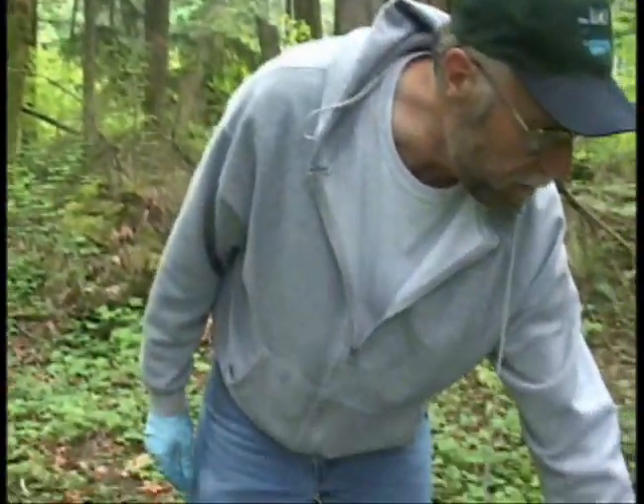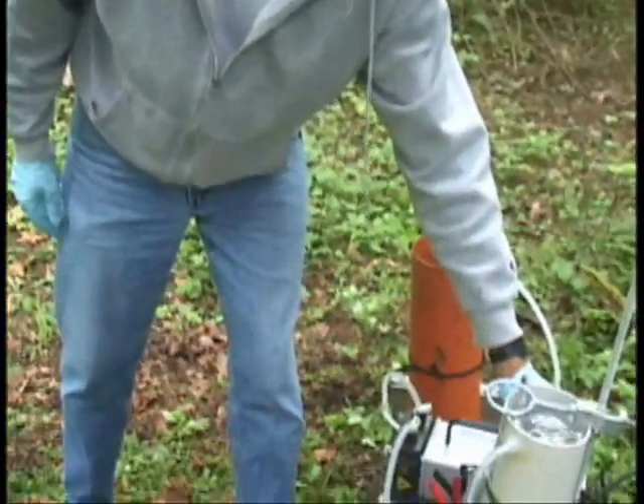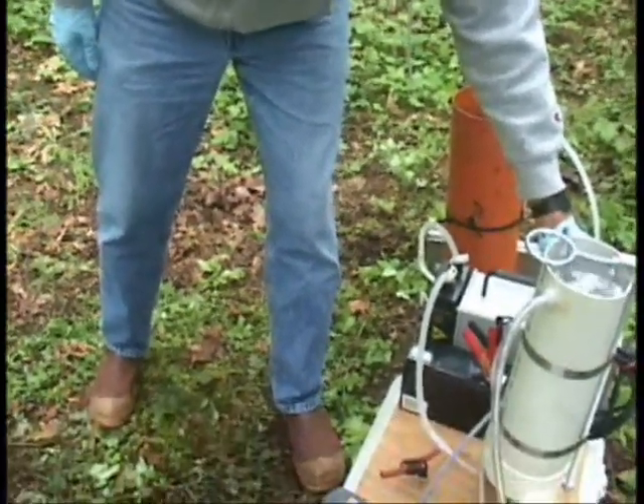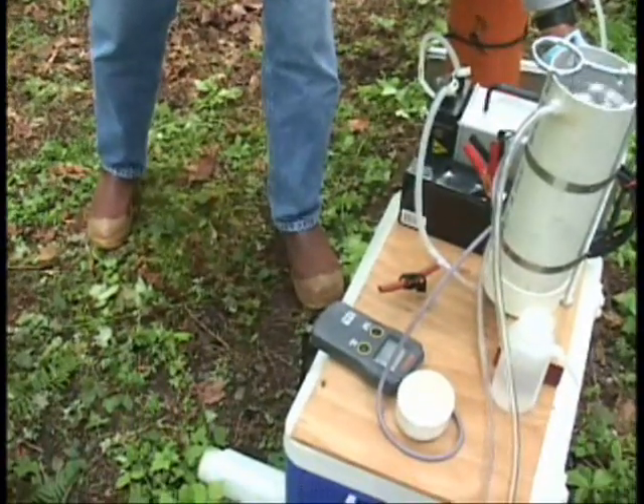The purge parameters need to stabilize — that's really the indicator. At a minimum we usually pump out at least three well volumes, but the critical thing is to get the purge parameters to stabilize. This well looks pretty stable from the get-go, but we've finished purging after about four well volumes with purge parameters stabilized. I've now reduced the pumping rate to between 100 and 200 milliliters per minute, and we're going to start our sampling.